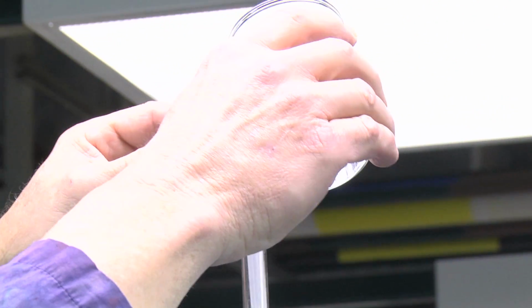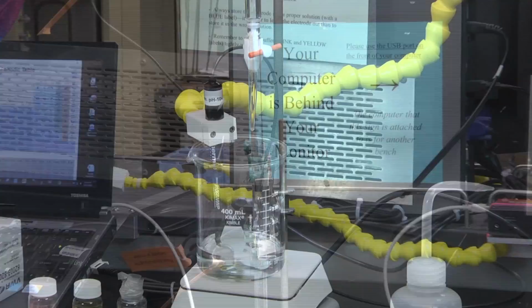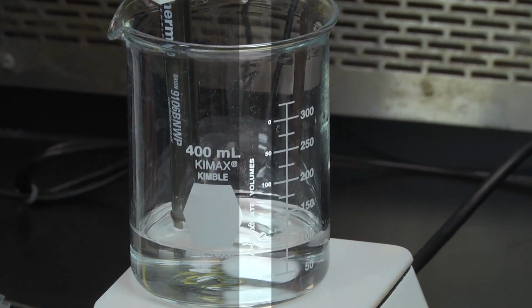A burette containing the sodium hydroxide solution is arranged above the beaker in such a way that the solution coming out of the burette will not strike the electrode or the sides of the beaker.